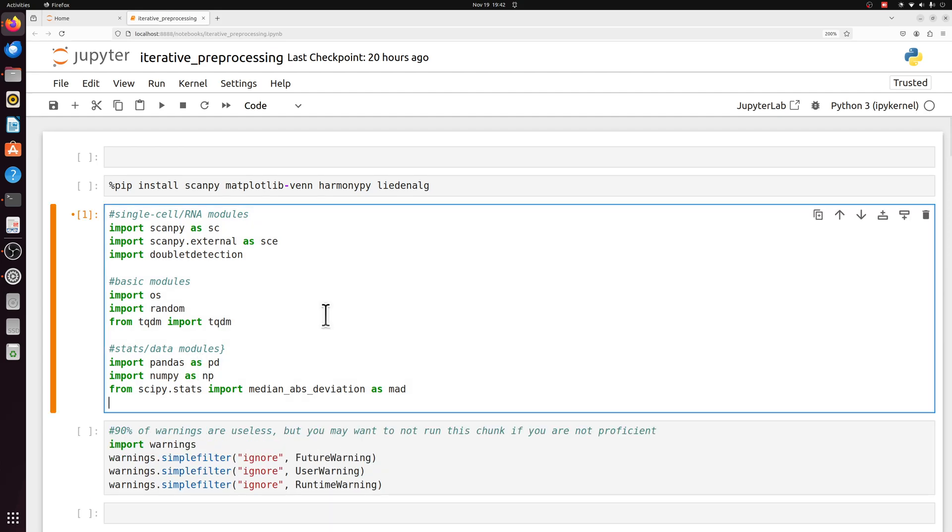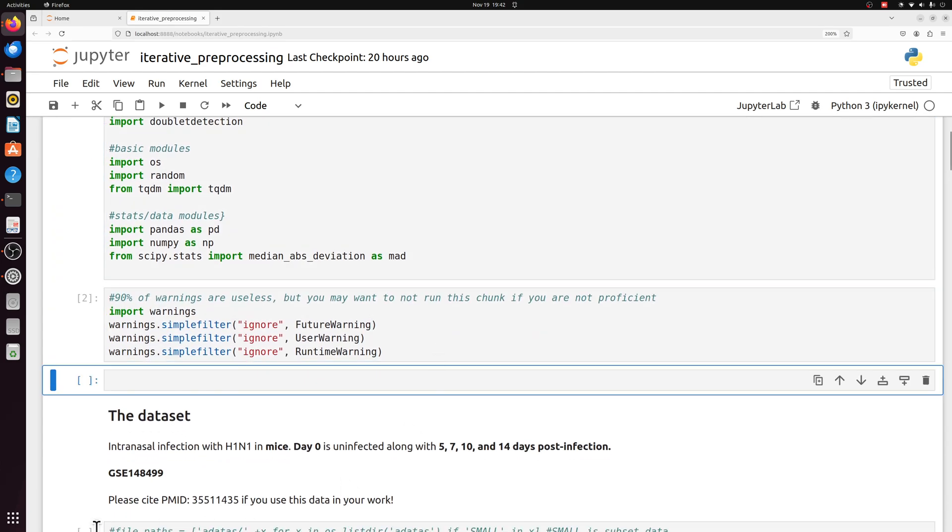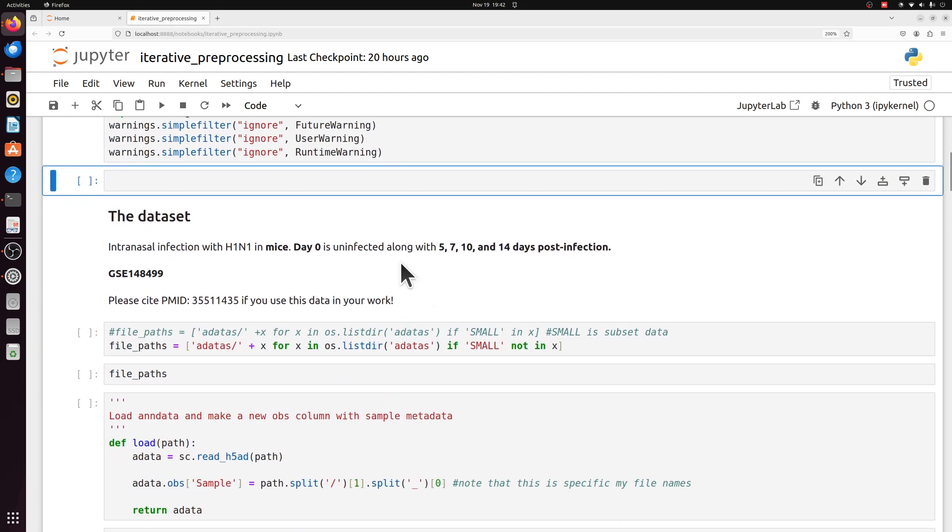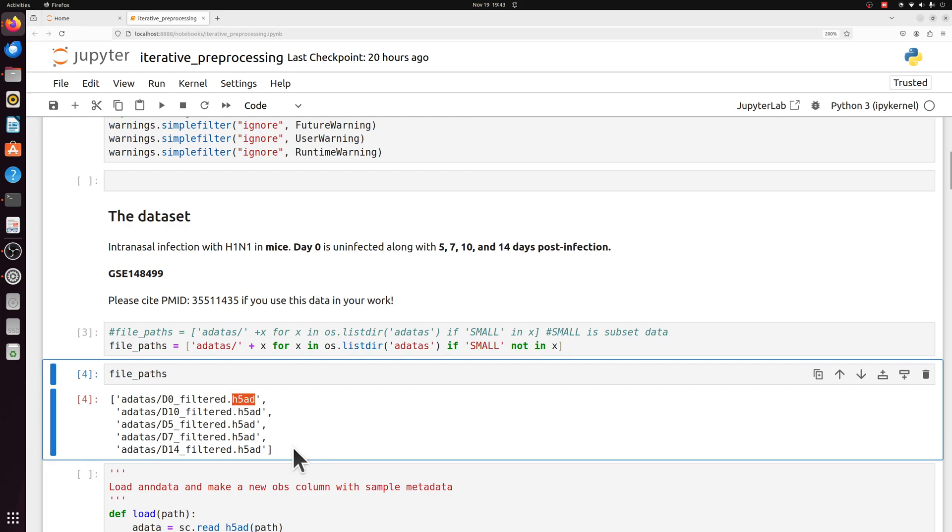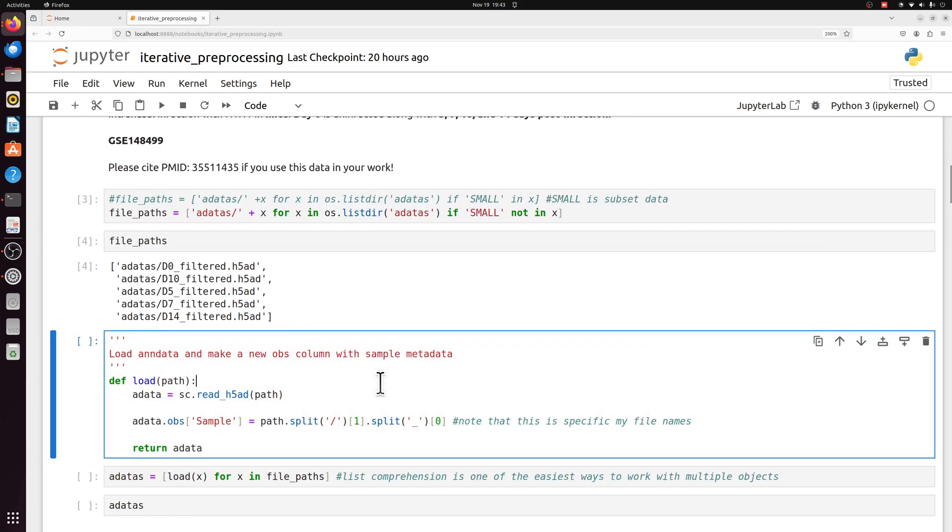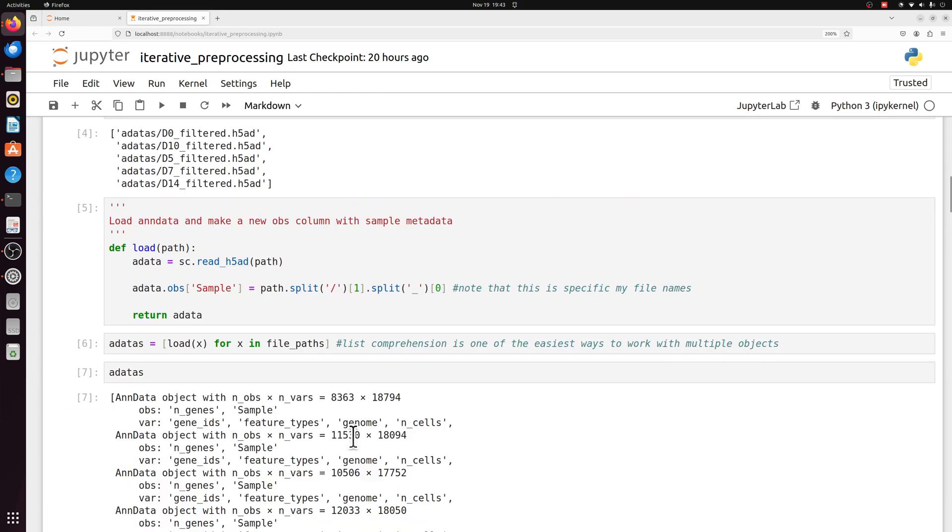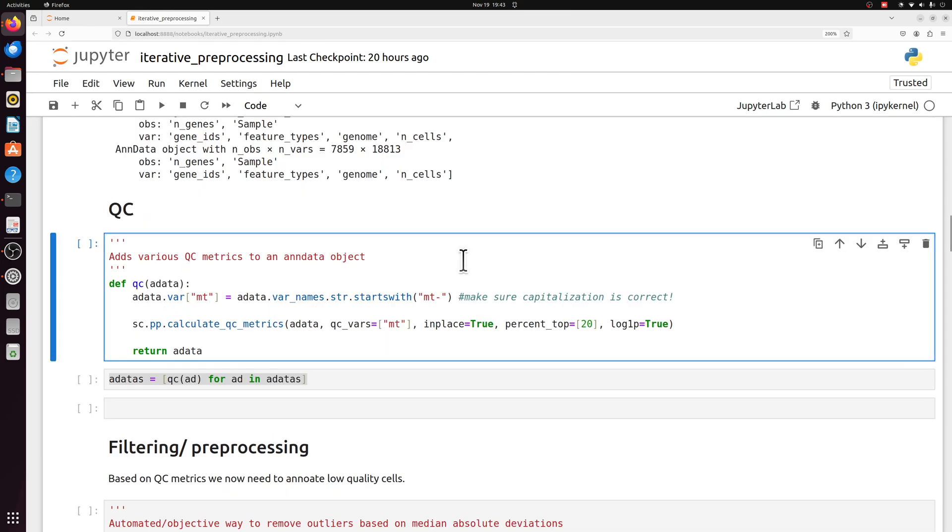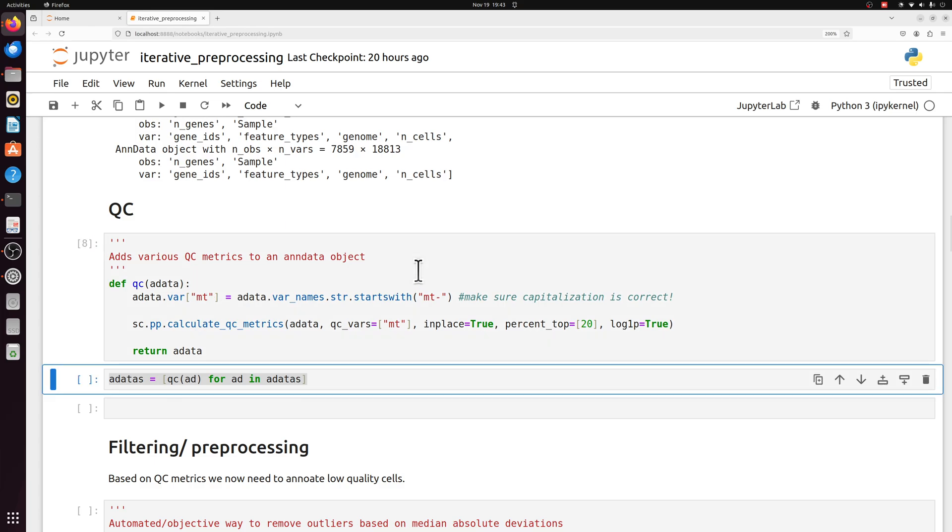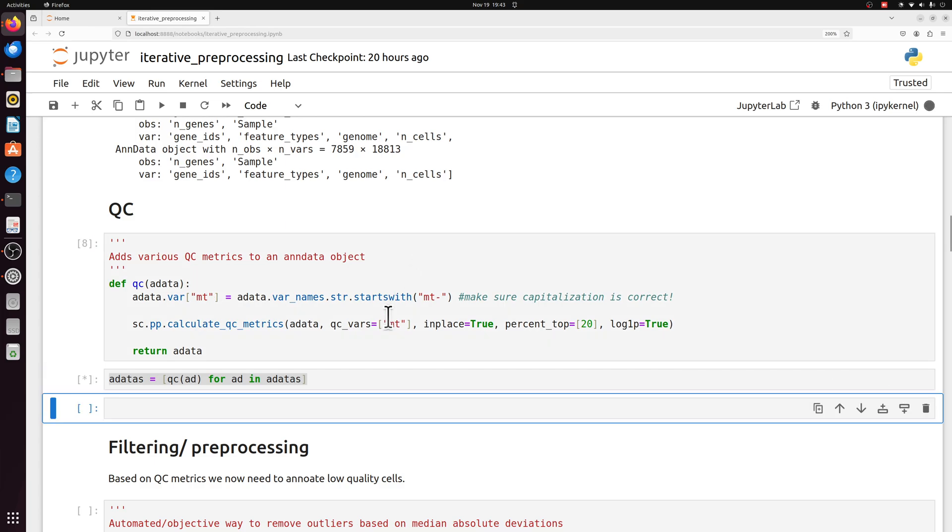We're going to go through this very quickly because I've gone through a lot of this before. We're going to load in some modules, silence some warnings. This data is mouse lung data. We have five different samples. I already have the samples as H5ADs, so I'm just going to load those in. And we have our five samples ranging from 8,000 to 12,000 cells.